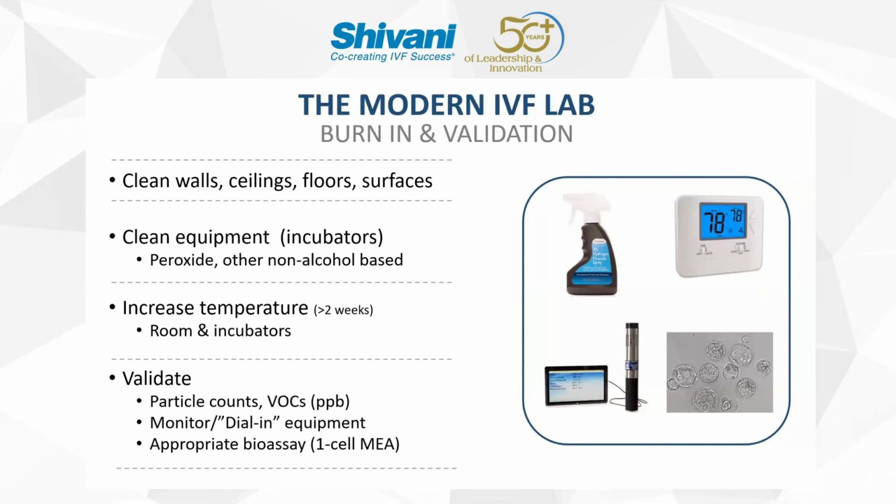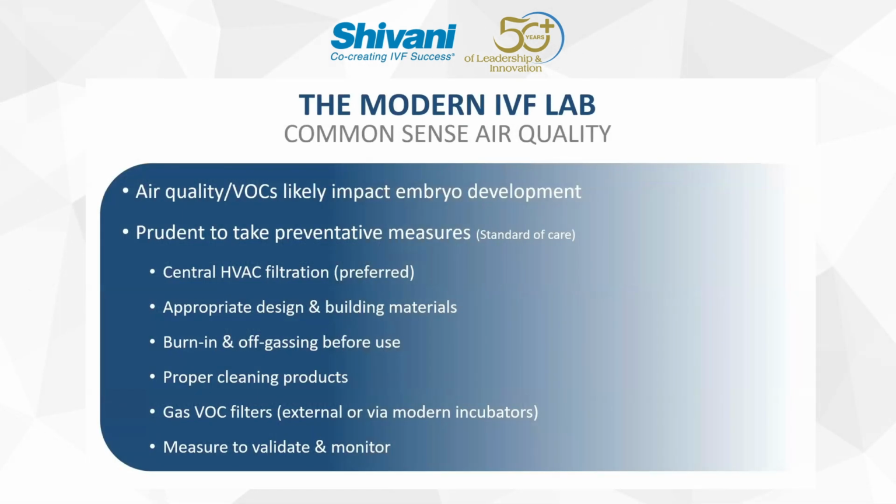Finally, you've spent all this time and energy to maintain good air quality in the lab. You want to make sure that when you clean and disinfect your lab, you're not reintroducing those VOCs. So there are different approaches to make sure that when you're cleaning, you're using the proper cleaning supplies that are VOC free or low VOC, and then monitoring and validating that your procedures aren't inadvertently compromising air quality.